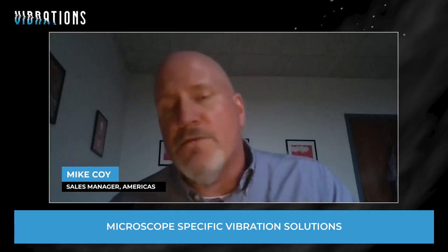So those are the places to start, and that probably covers 90% of what happens, right? These are very complex instruments, and obviously the performance of the environment can be incredibly complex. So repeated image artifacts are really the key thing to look for, and simply not reaching levels of performance that the instrument is capable of. That's where I would start.